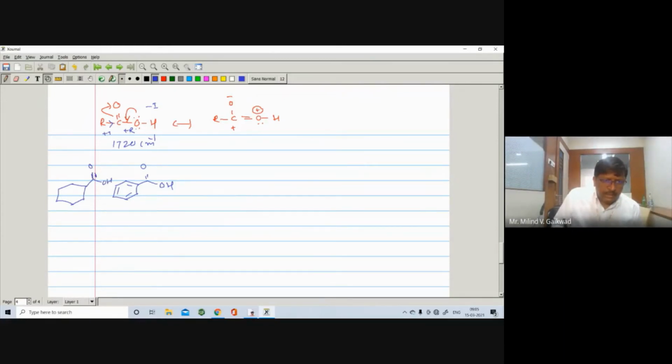Okay, so it is seen that this will appear at 1725, then this one will appear at 1700.